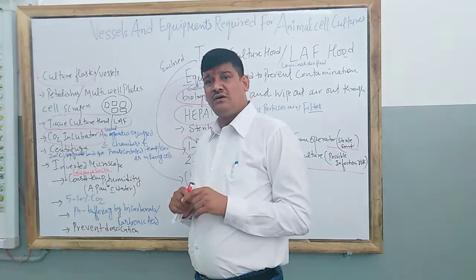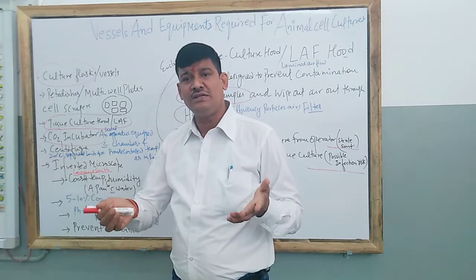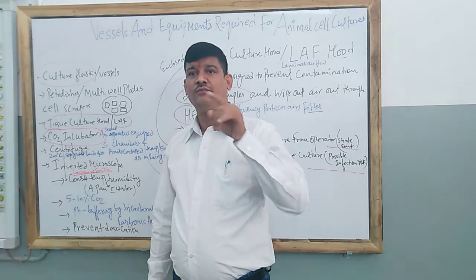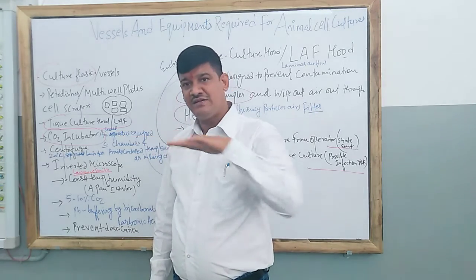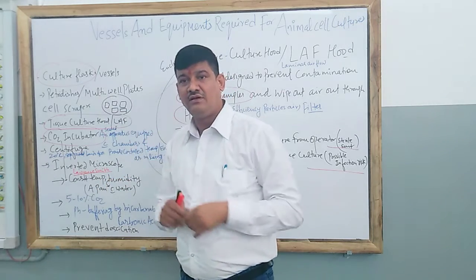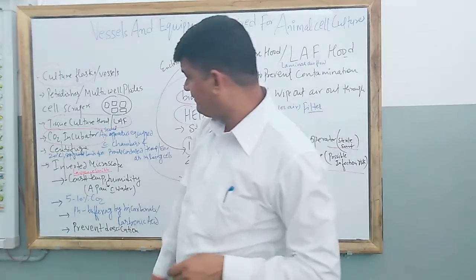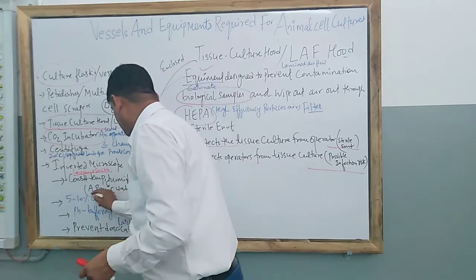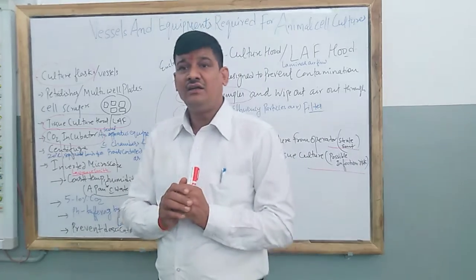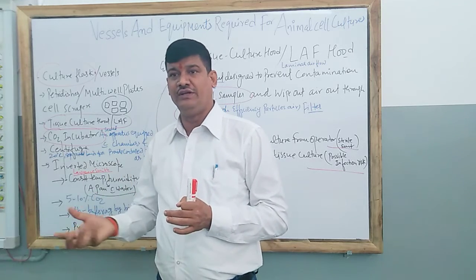Now in the CO2 incubator, the question is how we maintain the pH and how we maintain the temperature. Already I just told that it is maintained by placing 5 to 10% of CO2 in that chamber. Apart from that, a pan of water is kept inside the chamber. That is, the CO2 incubator has 5 to 10% of CO2 as well as a pan with water. The main function of this water is that it creates the artificial medium and generates the humidity.